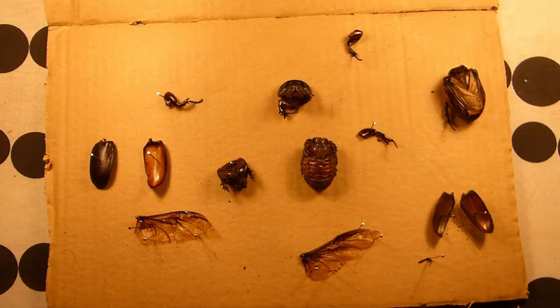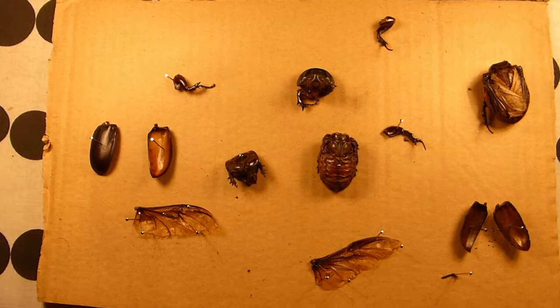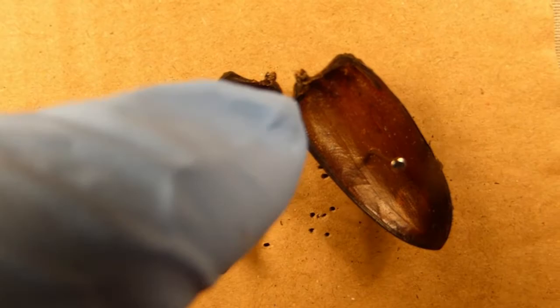In beetles one pair of wings is the flight wings, which you can see here. The other pair of wings is hardened into elytra, which is a protective covering so the delicate flight surfaces don't get damaged. There's one pair of elytra from one of these beetles — that is the outer surface, this is the inner surface. They fit together down there, and you can see the wing attachments here.